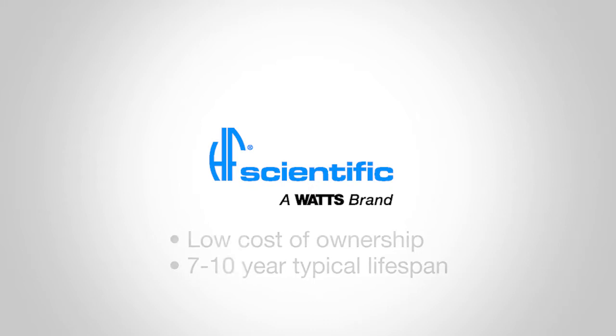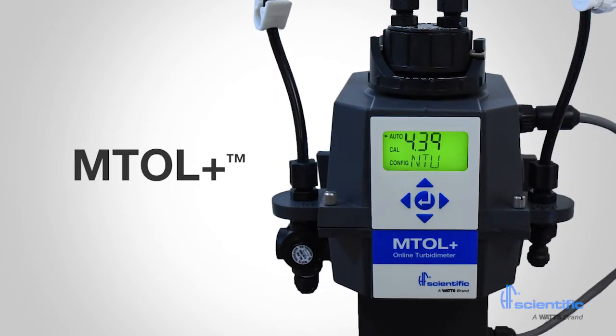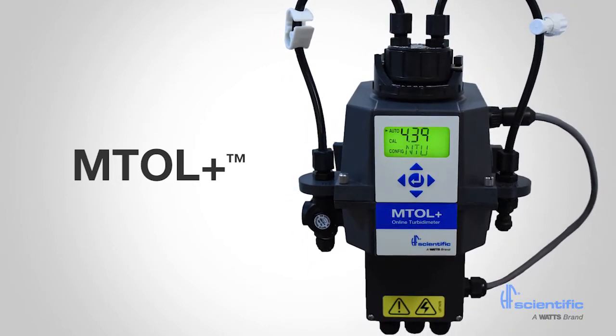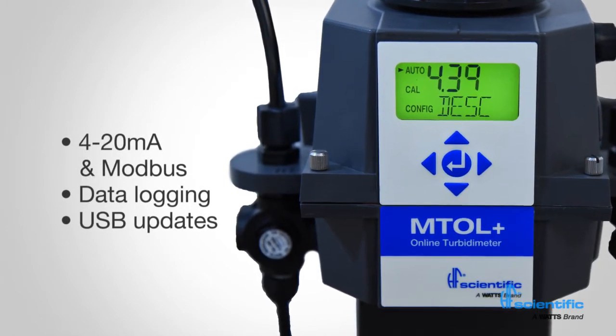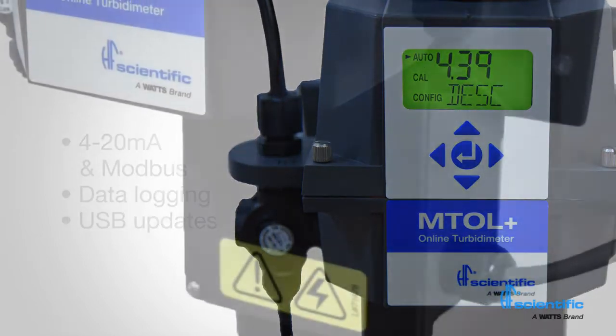This video features HF Scientific's latest turbidity meter, the MTOL+. While this instrument has much in common with the previous generation, it has been redesigned with a 32-bit ARM core processor to allow for enhanced features. Other new features include simultaneous 4-20mA and Modbus outputs, data logging of readings, USB software updates and USB data downloads.